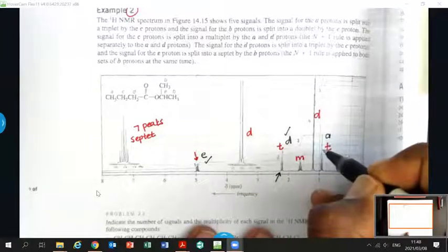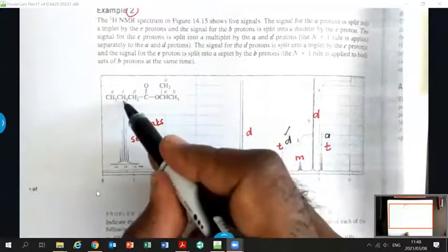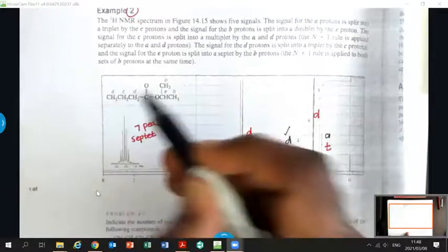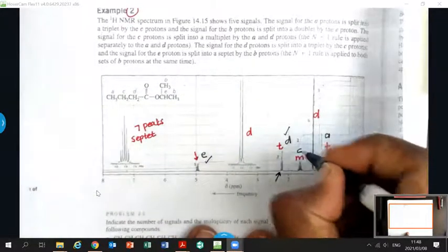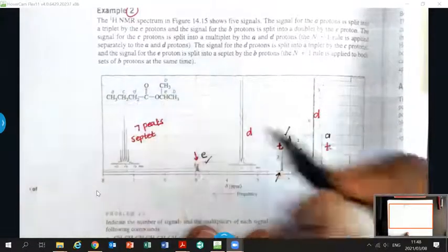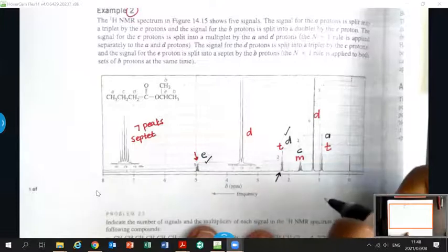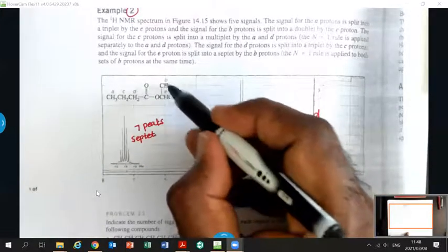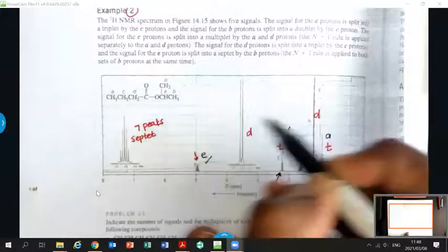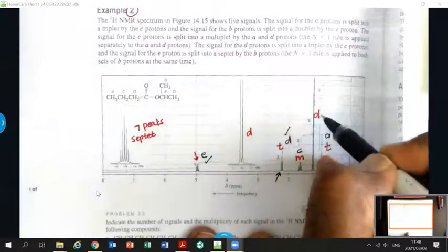All right, I've got 2 more resonances. This middle one, as I said, is a multiplet because I've got a proton group here and a proton group here. So this multiplet C, I can see integrating to 2 protons. This has 2 protons on it, so that must be fine. And then my equivalent CH3 groups next to a CH group, so it must be a doublet, and I see a doublet here.